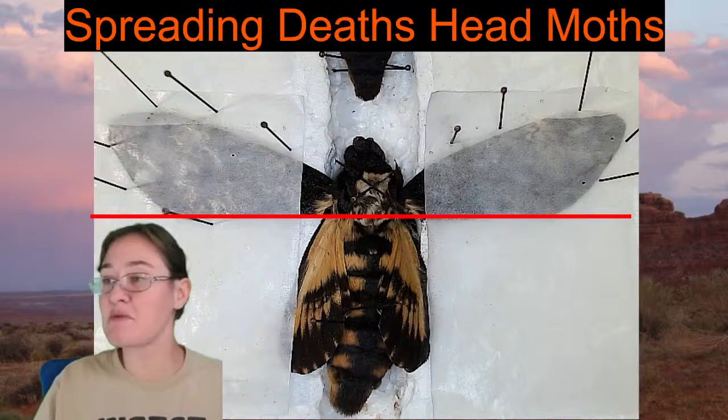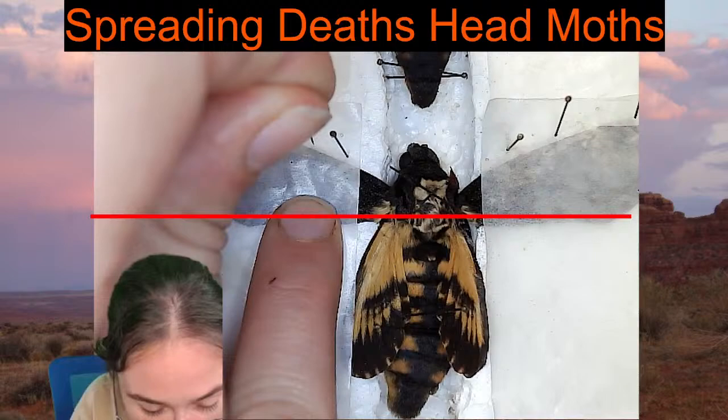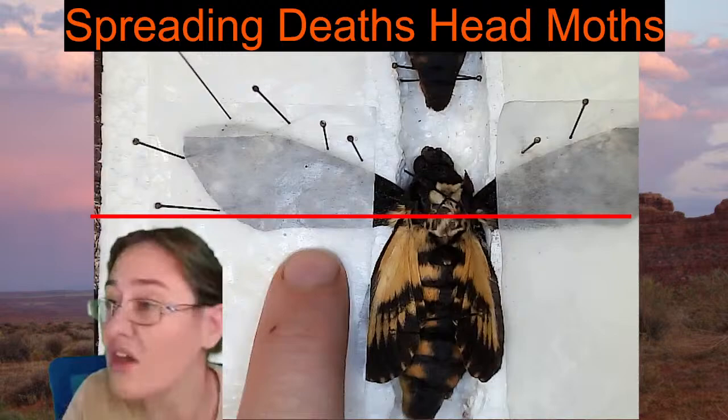All right, and I'm going to be pulling the hind wings up too. So I left a pin here, and I don't need that one there. That should hold that wing, so we'll get rid of this line for a moment.